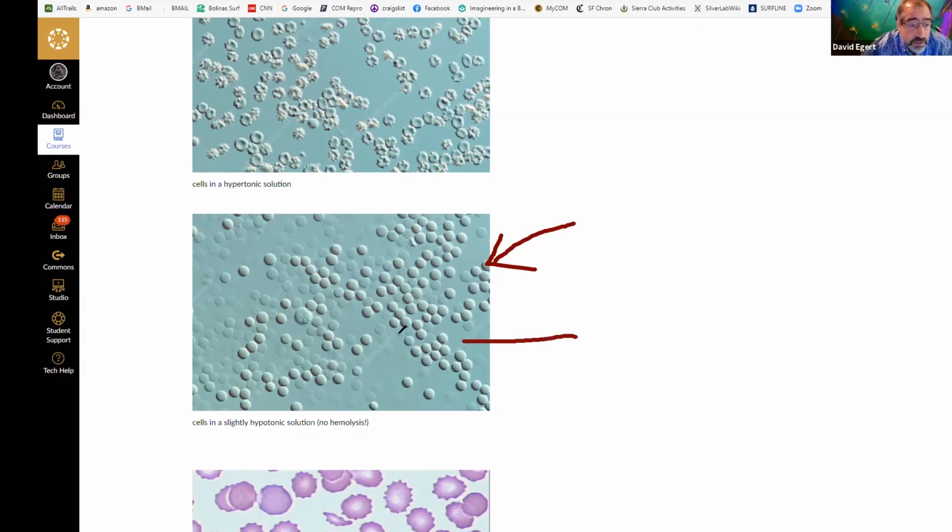Another thing in this picture, this bigger thing, you probably remember from anatomy that white blood cells are larger than red blood cells. That's a white blood cell. If we used ammonium chloride, this one would still be alive. Everything else here would have popped. But the white blood cell, which does not have that bicarbonate chloride transporter, would have survived the onslaught.